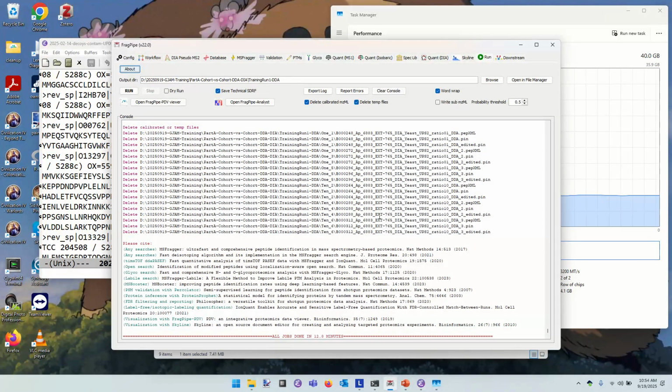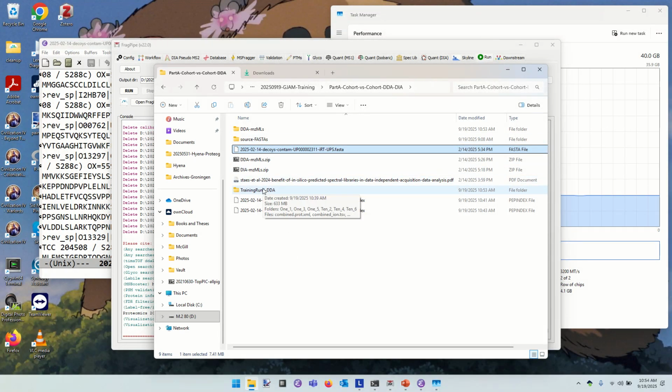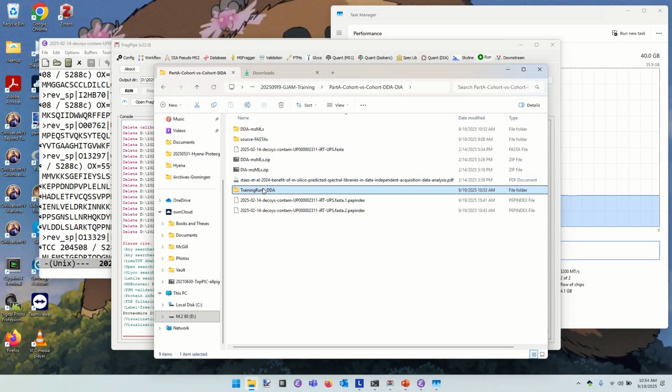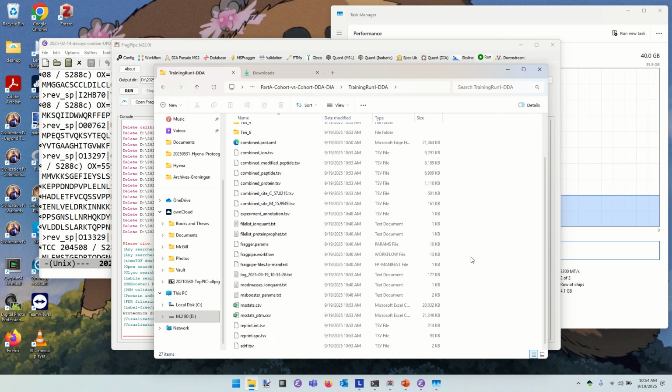All right, so at the end of the day, we get our report that all jobs are done. And if we click over to our directory, we can see that training run 1 DDA was the directory I created. It's populated with a whole bunch of files. All right, so what is it that we would want to look at here? I think that these TSV files are probably the most useful thing.